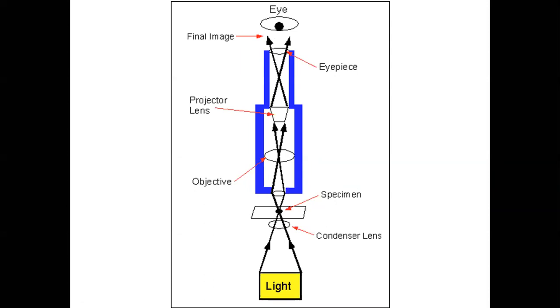So depending on the traveling of light within the specimen, or how the light is affecting the sample, or how the light is interacting with your specimen, whether the light which is traveling here is absorbed or deflected or reflected by this specimen, or whether the light is traveling through the sample.